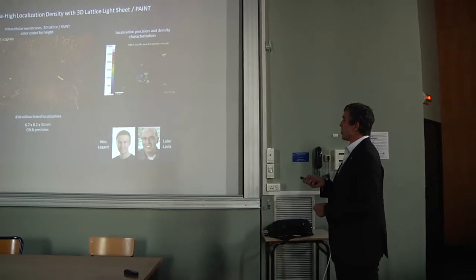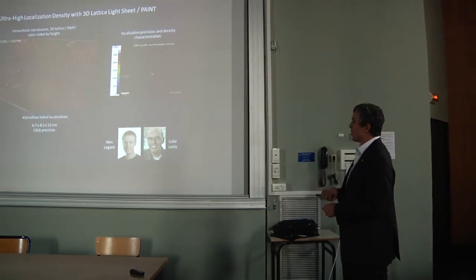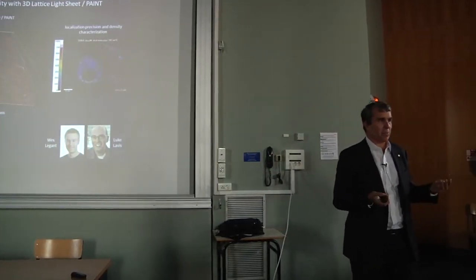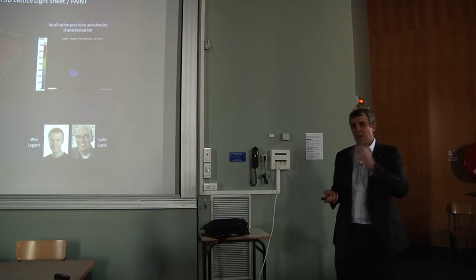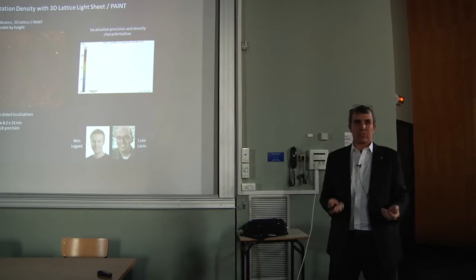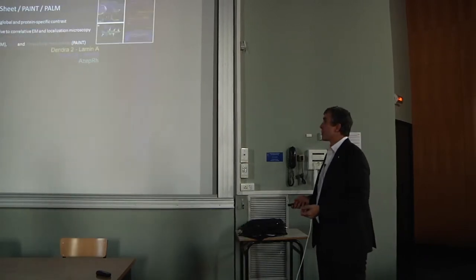This is the same example, where we're characterizing the resolution not by line cuts, which I believe is a bad metric, but rather by a combination of the localization precision and the density of localization events that we're able to see.